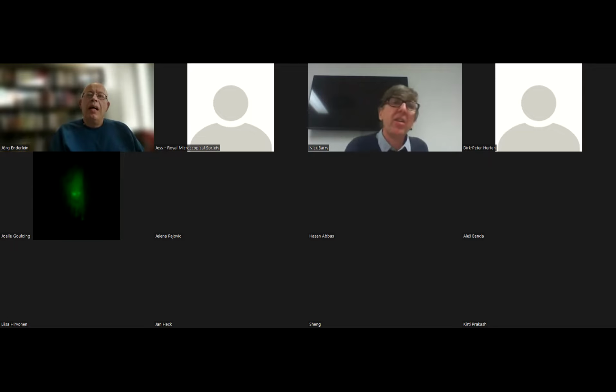Also the spacer layer, silicon dioxide on top of the graphene, has basically a negligible effect on this metal-induced energy transfer. This is not changed, because this is really the interaction between your graphene excited electrons and your dye molecule. But we use this spacer layer simply to protect or to shield the biological sample from the highly hydrophobic graphene surface. I think a cell will not be happy when it sits on graphene. So it's simply a protecting layer, and it's very thin. We are talking about something like 5 to 10 nanometer quartz. It's a very thin layer.